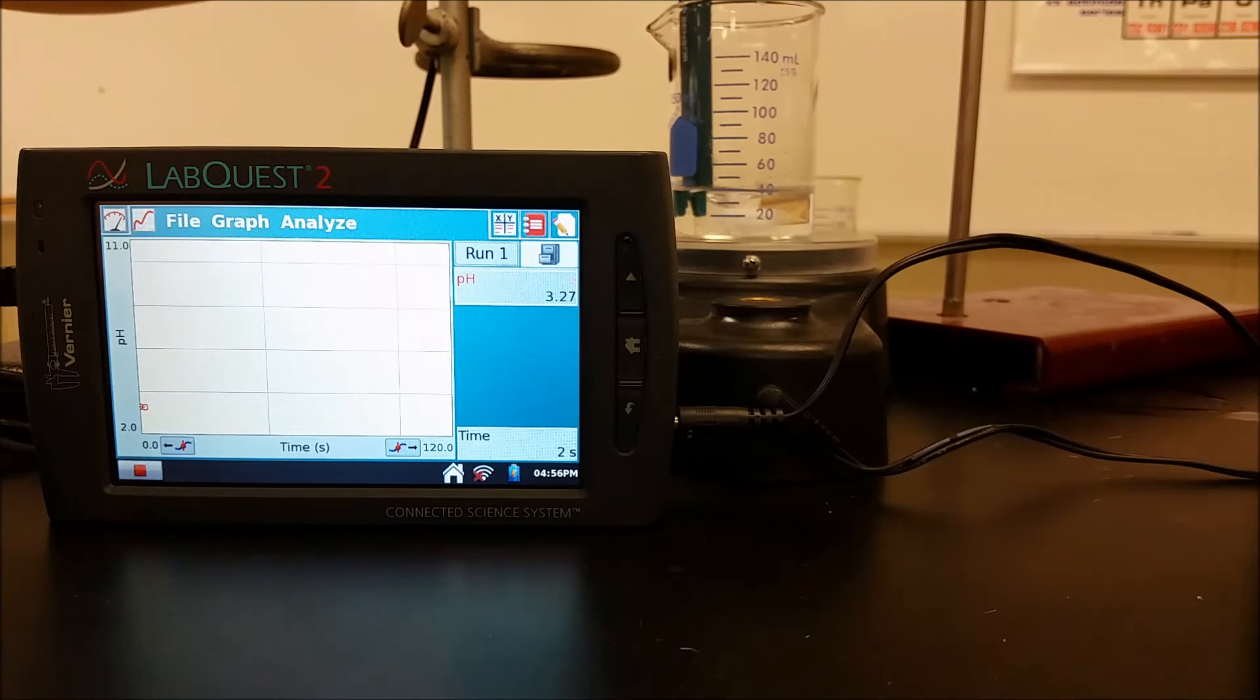So we're starting with our acetic acid again, now I'm adding the phenolphthalein to it, and now I've started the pH meter and the base is coming in. So you can see the pH starting to rise, we're into our buffer region of the titration curve.